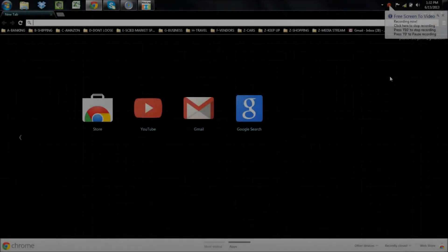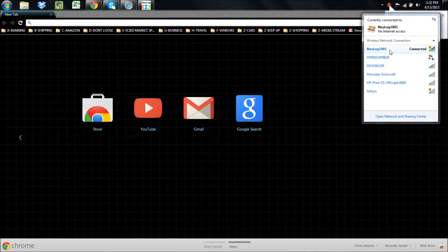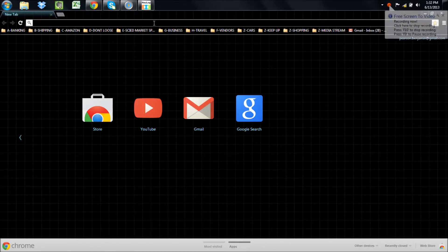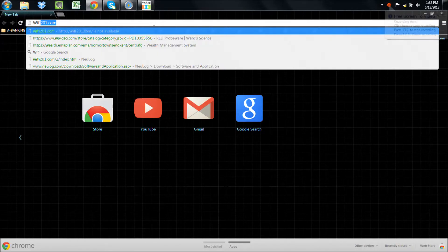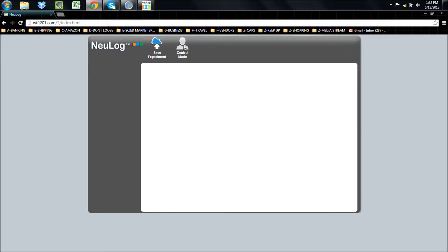In the wireless networks list, locate the Nulog network corresponding to your network code. Connect to it, open your browser, and type Wi-Fi201.com into the search bar.